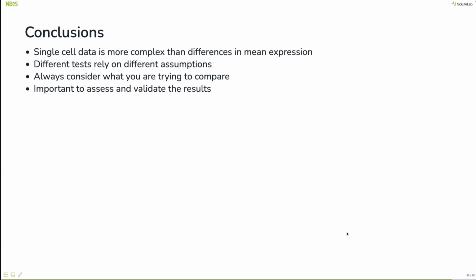Because sometimes in such particular settings, it's really hard to design an experiment where everything can be done at the same time. So it has to be done in batches. So do you think it should be corrected for the batch effect first? It's not really like that. If the batches are completely overlapping with your experimental groups, there's not really a way to correct for the batch without removing your differences between your experimental groups.